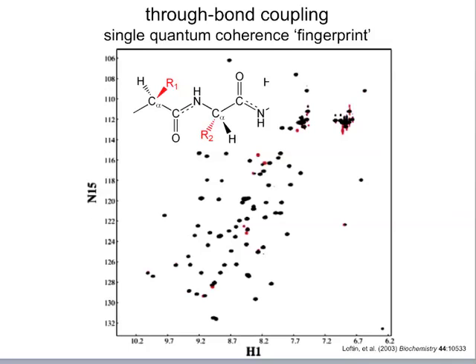By screening the proton signals in this way, effectively screening out everything that isn't bound to nitrogen, we drastically simplify our NMR spectrum from potentially thousands of lines to only 100 or so, depending on the size of our protein. One, again, for each peptide bond. This is called a fingerprint because it's unique to each protein. Each individual amide nitrogen proton pair has a unique chemical environment, and so they'll have a unique set of chemical shifts. And so we can immediately tell that A, this protein is folded, and B, that it's our protein of interest because it has this unique set of chemical shifts.